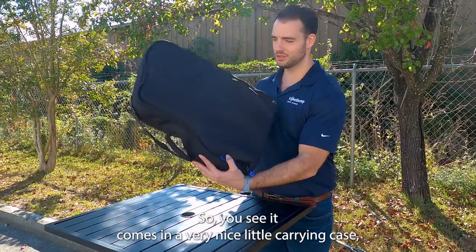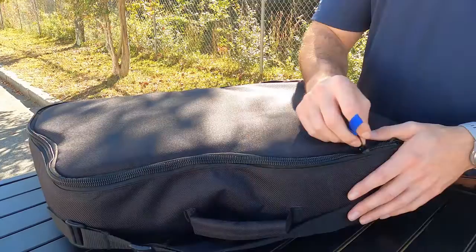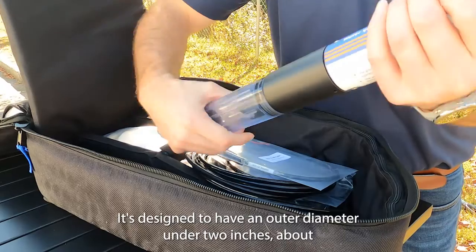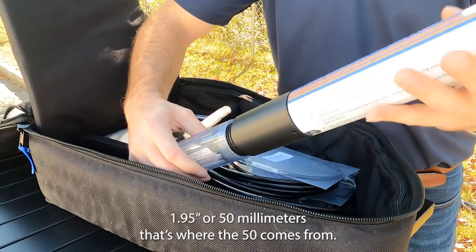It comes in a very nice little carrying case, so let's open it and see what's inside. This is the Scuba 50. It's designed to have an outer diameter under two inches — about 1.95 inches or 50 millimeters. That's where the 50 comes from.